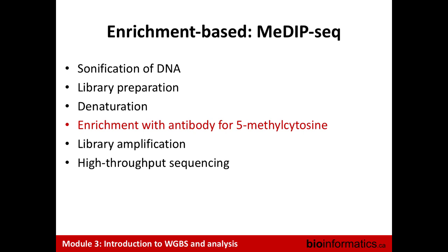I'm more wondering about the library preparation. It's just a ligation of adapters? Yes, it's a ligation. So you don't do any extra amplification, so you don't lose anything. Right. It doesn't matter if you lose methylation at that point, because you've already pulled down. Well, not if you haven't done the enrichment. That's the difference. Some people do it before. And before they do, I understand.